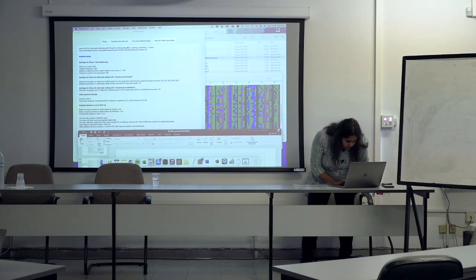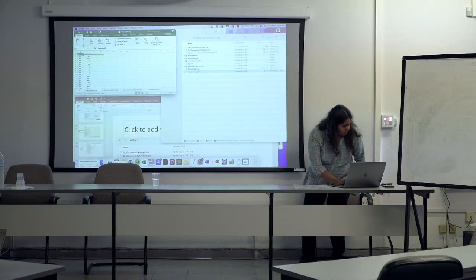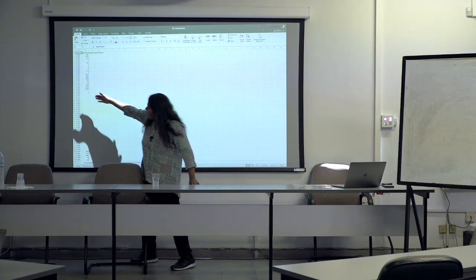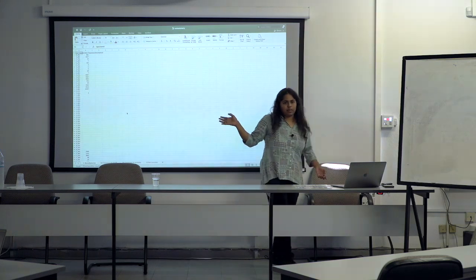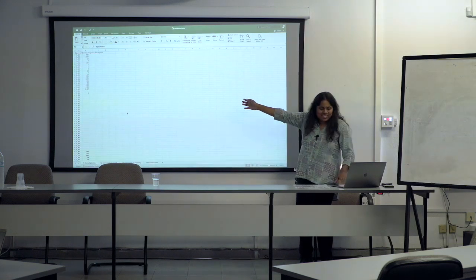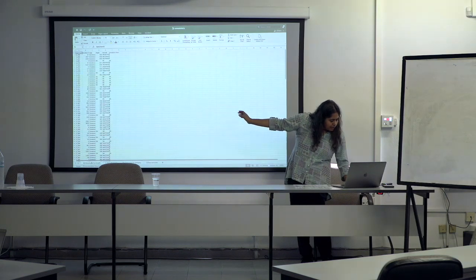In the case of this particular run, what Ben gave me was lots of indices. Basically, there are 500 indices. These were not used in this particular experiment, so that's why you have so many empty cells here. It's not that we didn't get reads for them; they were simply not there. So yeah, the various steps are here.